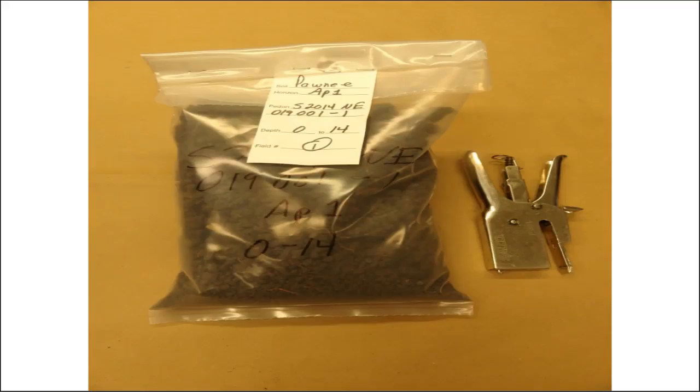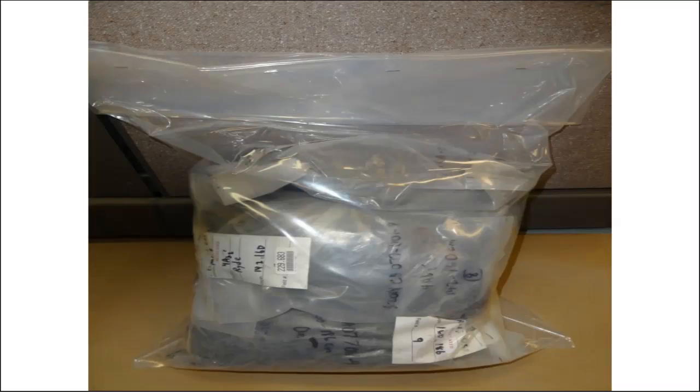They're 8 mil bags. Your typical bags that you might buy to put soil samples in, like Ziplocs, are maybe 1 to 4 mil. These are 8 mil, so they're a lot heavier, and they do keep us in compliance with APHIS. And then a pedon's worth of bulk samples, like you see here, would be put into a secondary container, a secondary liner, and we'll send those liners out when you request supplies from us.